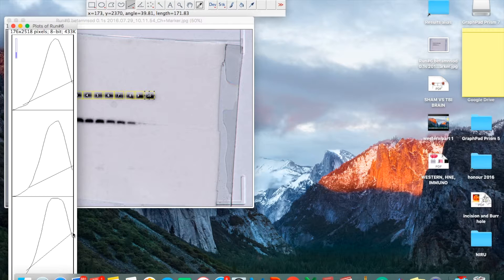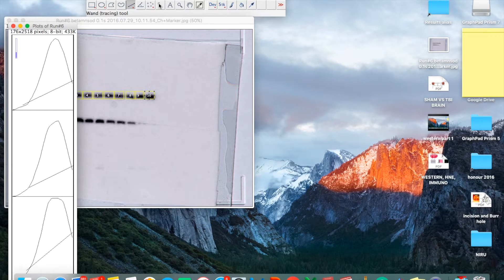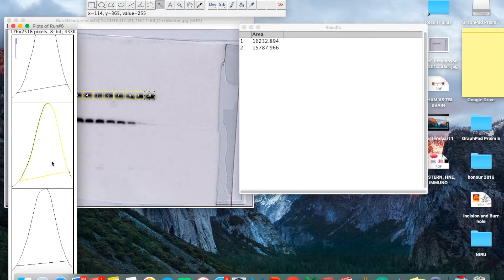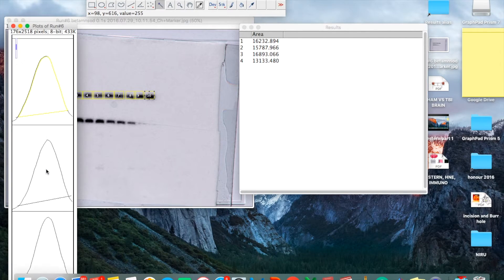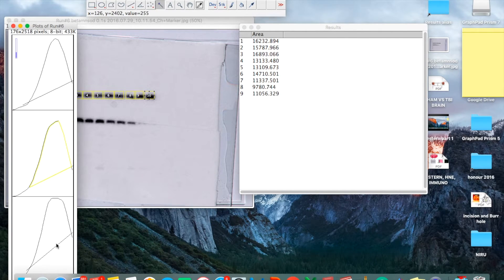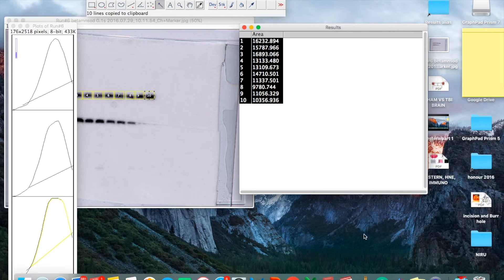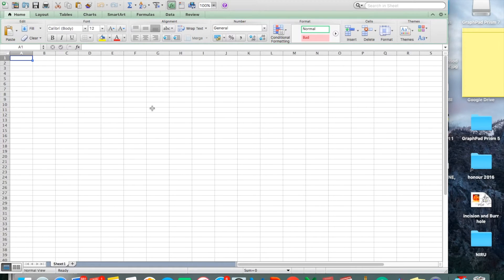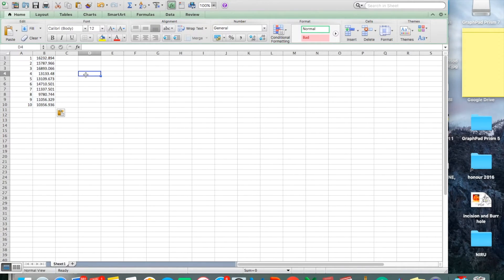Once you've done that, select the wand tool. Go back to the first peak and select that area, then select each subsequent peak area for lanes 2 through 10. So there are 1 to 10 areas representing those respective peaks. Copy all of these with Control C and paste them into an Excel spreadsheet with Control V. That is your data for Method 1.